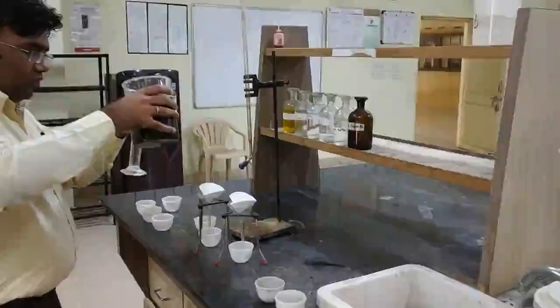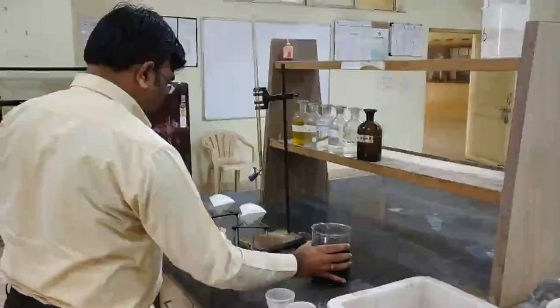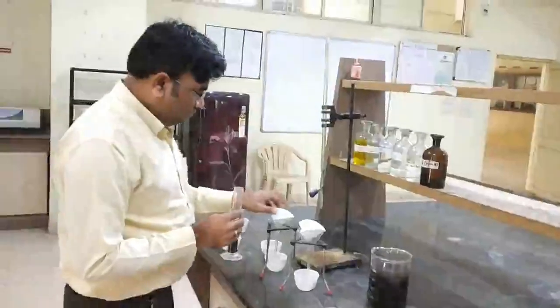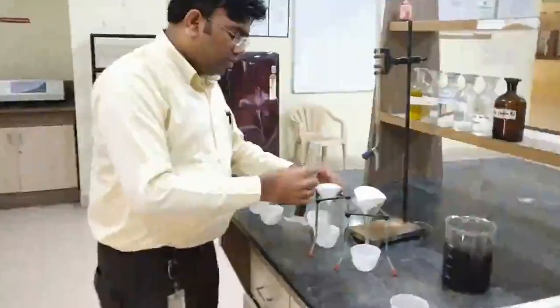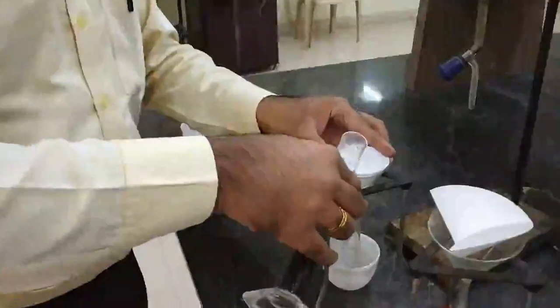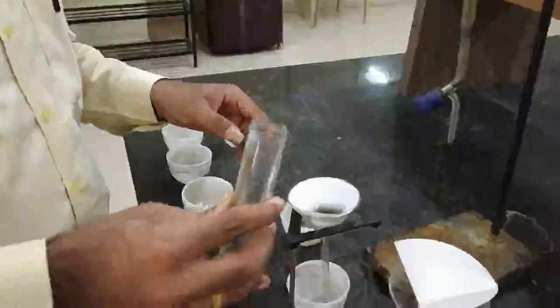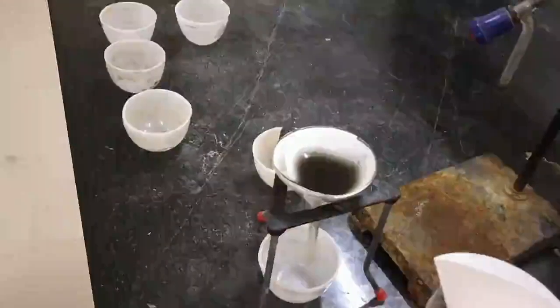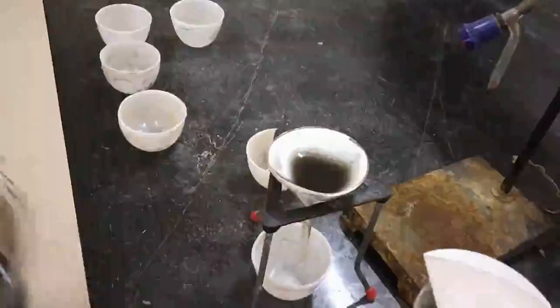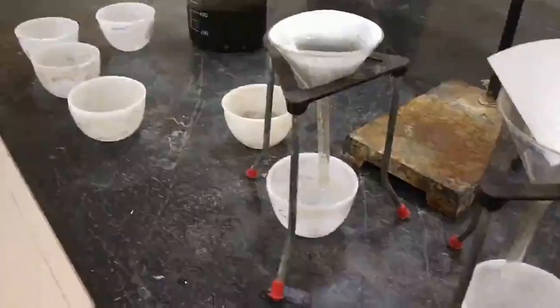So I am going to measure 25 ml of sample, and I am going to put it in crucible C first, so you can see properly how the sample is going to pass. I am going to put it here, just a small amount. Carefully, the sample is being put. Slowly, the sample will get filtered through this filter paper, and the filtrate will get collected in this crucible below.